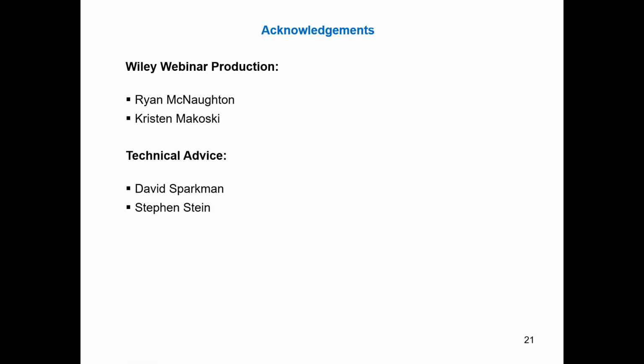He's also a professor at the University of the Pacific, and he teaches some very good classes on interpretation of EI GCMS data. And then I'll always have to mention Steve Stein. There are so many people that work at NIST, and Steve is the leader of this effort. He has so many talented people that always have original ideas on how to do things, and they turn them into products that make the libraries more powerful. Their main product is the library. A lot of the software was developed for them to do their job in confirming that it's good quality data to put in the library. But they do share the programs with us, and I greatly appreciate that.